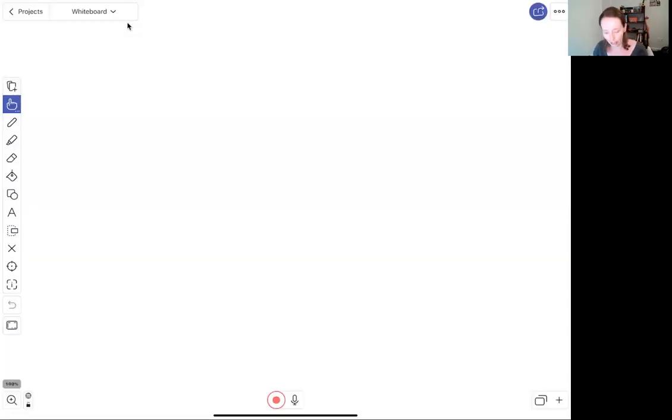So the focus of this video and what we're going to address by the end of this video is how do we go about taking a gene out of one bacteria and introducing it into another bacterium such as E. coli. So let's go ahead and bring up the whiteboard to get going on this, because we will need to draw some things out here to illustrate what's going on. So what we're going to be looking at are some terminologies that we will need to know for this. The first term that we are going to be using in our discussion is the term vector.